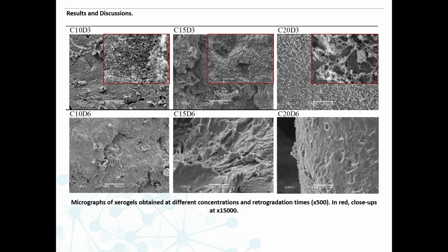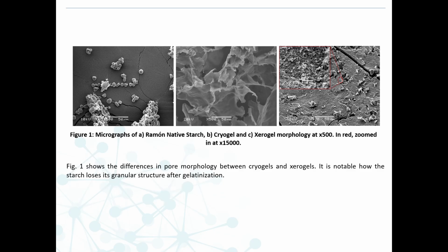Compared to the native granules in the images, we can see how after gelatinization, the granular structure is lost and the gel structure is generated. The cryogels present large structures formed by ice crystals.